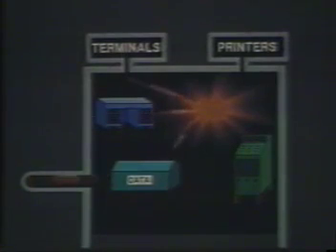This helps Tom and Keith monitor the working conditions of the FACS. When the correct number of cell data points have been collected for a sample, the Secretary will close the FACS interface and await Tom's command to view the label for the next sample. This cycle will be repeated for each sample in Tom's experiment. Now let's watch the collection process from the outside.